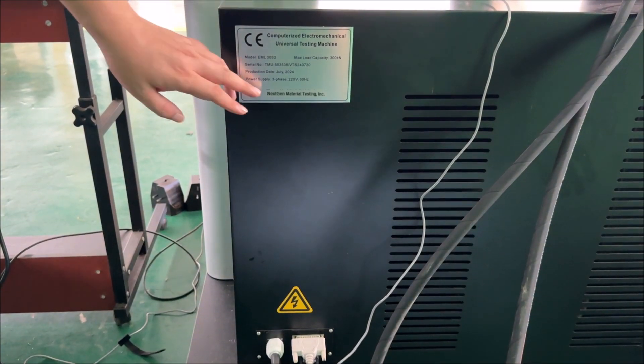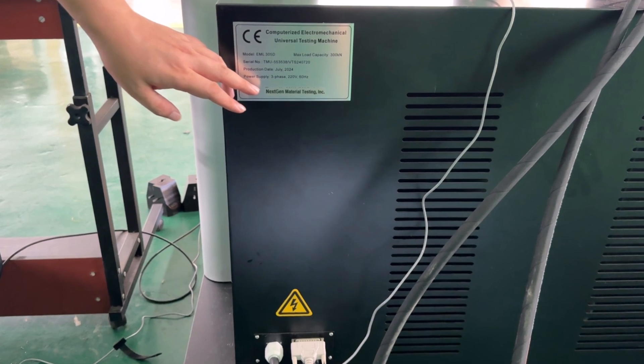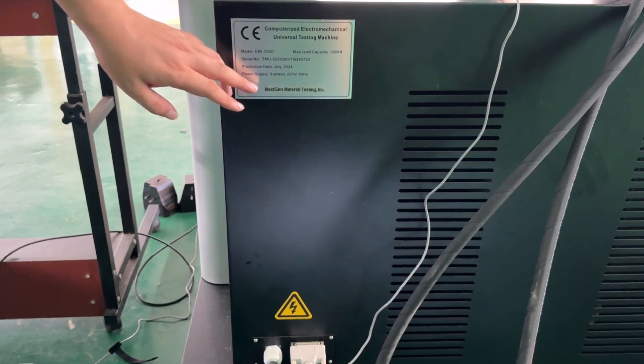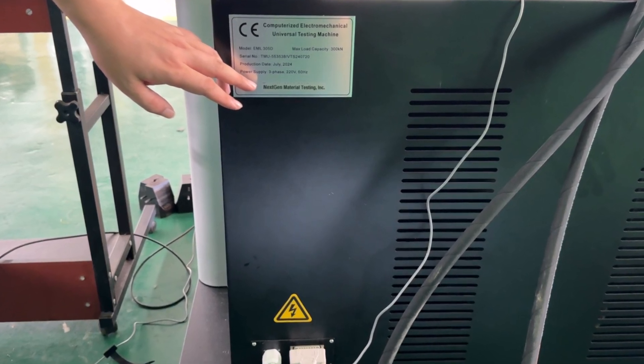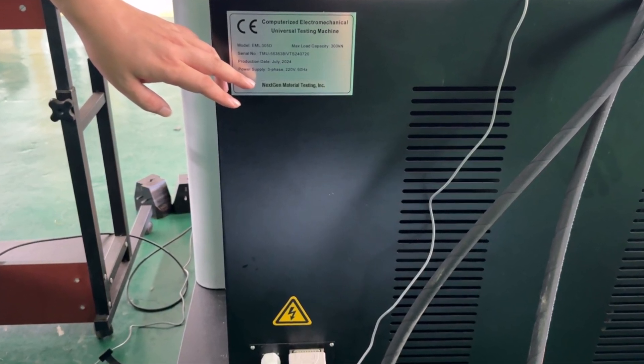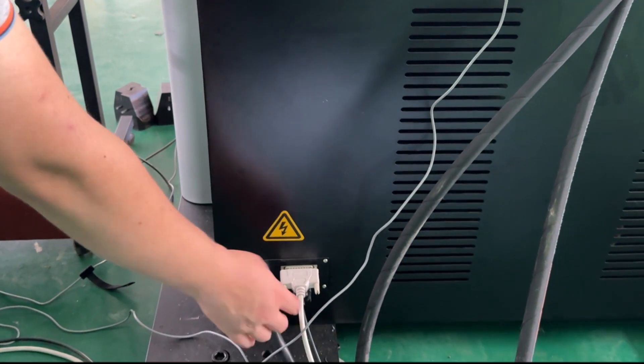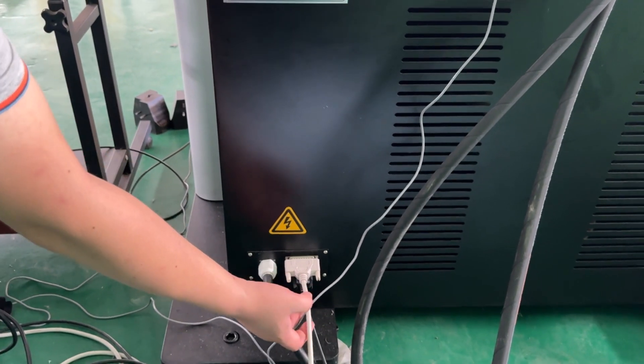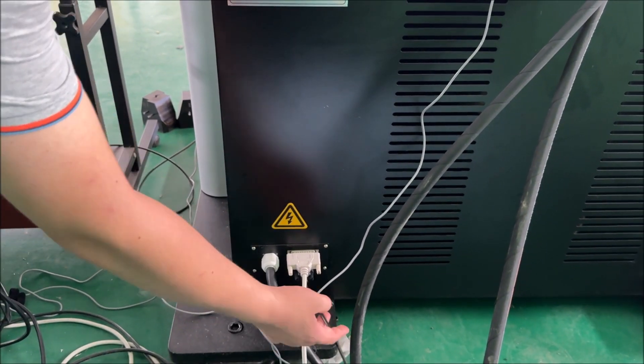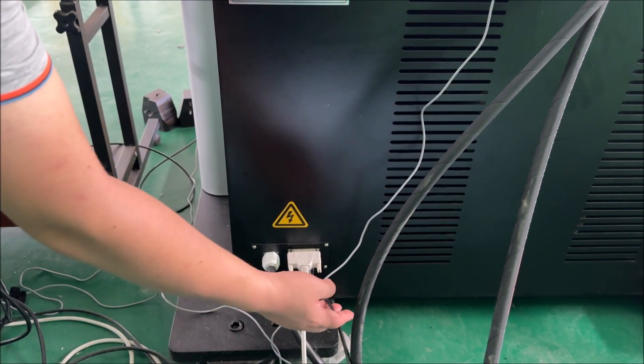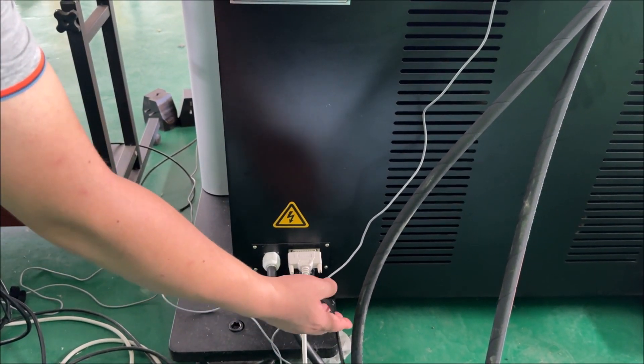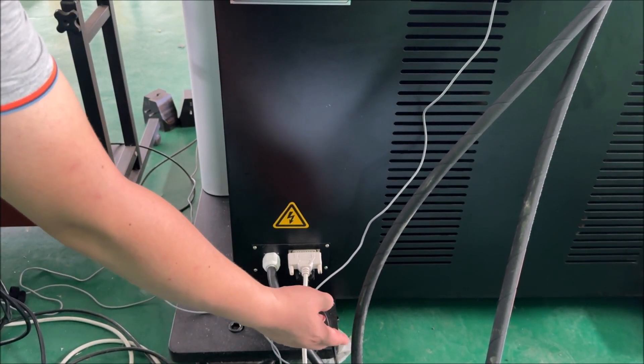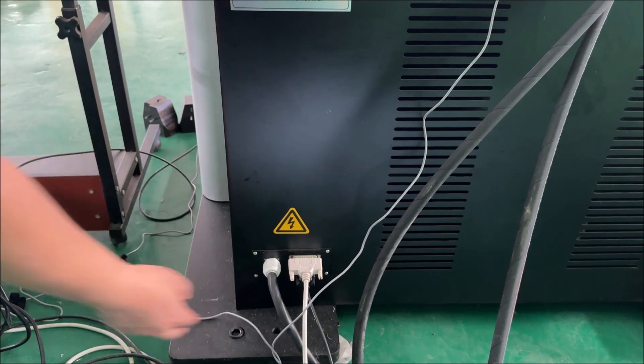The mainframe power is three phase 220 volts, 50 to 60 hertz. This is the power cable, and here is the communication cable. This cable is for the 300 kilonewton load cell.